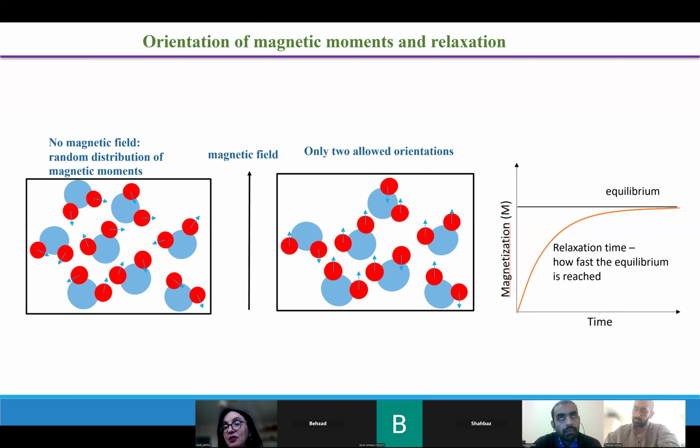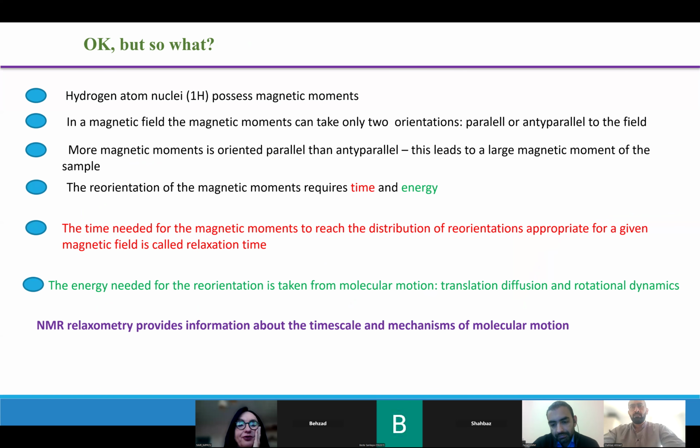And attention, the magnetization is built following an exponential function, which shows again that math is of essence. Okay, so after those short or long explanations, let us go point by point and tell me if you do not agree with some of the points, okay?